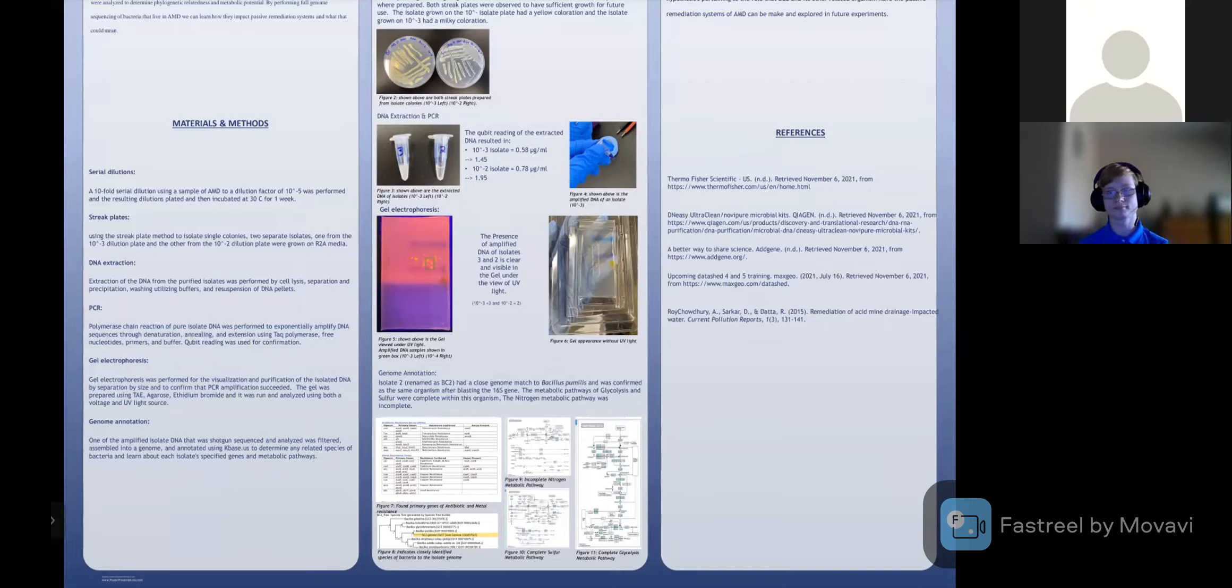Afterwards, using gel electrophoresis to ensure the presence of our amplified DNA of isolates, we can see on the right image, without the UV light, it's hard to tell where the DNA actually was amplified or if it was in presence. But when exposed to the UV light on the left side, within the green box being our isolates, we can confirm the presence of the DNA.